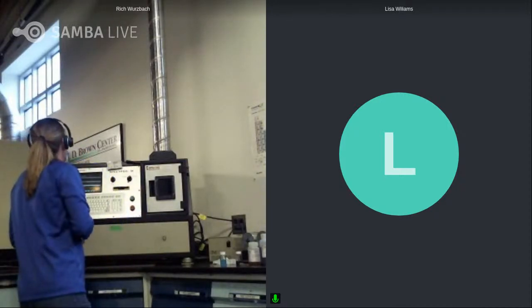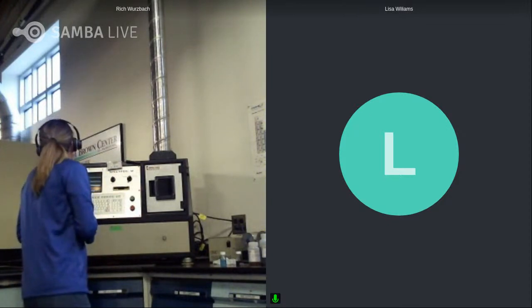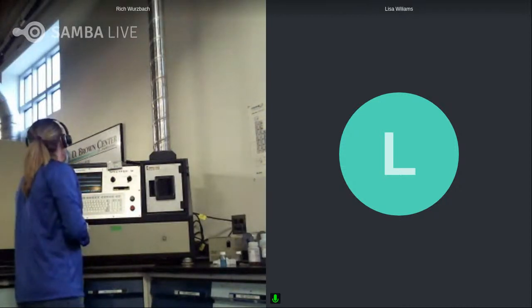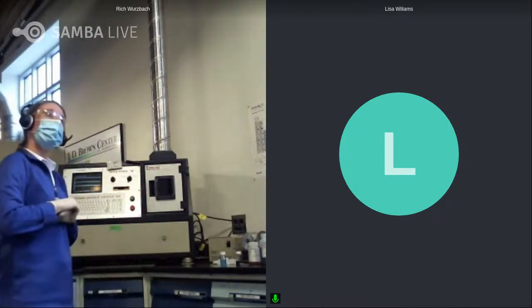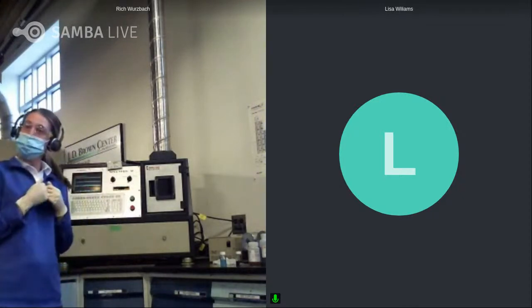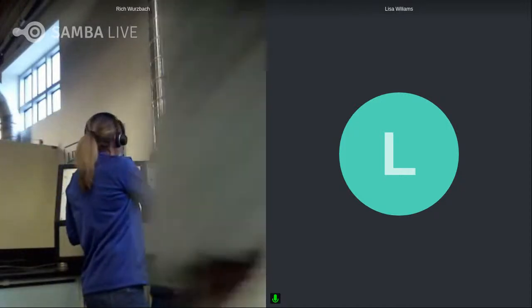All right, so my result, I have some lead, I have some iron, quite a bit of sodium, assuming that's probably dirt. And then I got a little bit of zinc, very little, and some phosphorus. So depending on the darkness, since that grease was dark, I'm wondering what else might be in this sample. I don't have a whole lot of background about this sample, so I'm simply speculating at this point. But we're in good shape here.